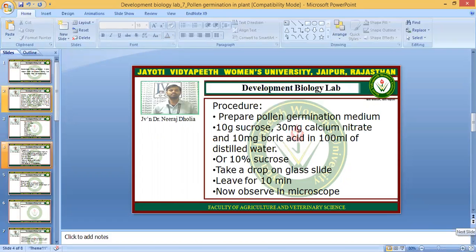Now for the procedure, we can use two germination media. You can prepare the germination medium by dissolving 10 grams sucrose, plus 30 mg calcium nitrate, plus 10 mg boric acid in 100 ml of distilled water. Alternatively, you can directly use a 10% sucrose solution in distilled water.